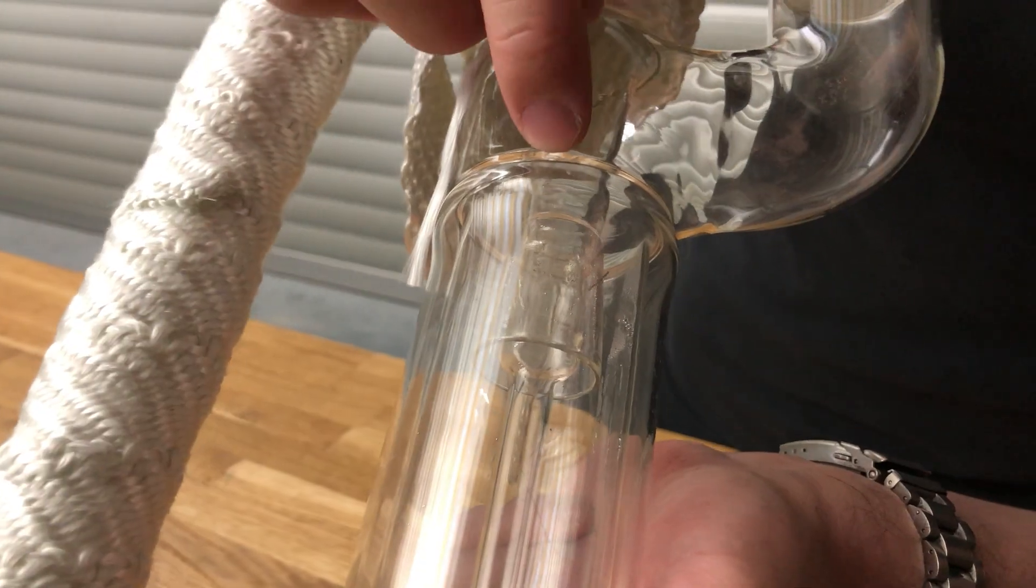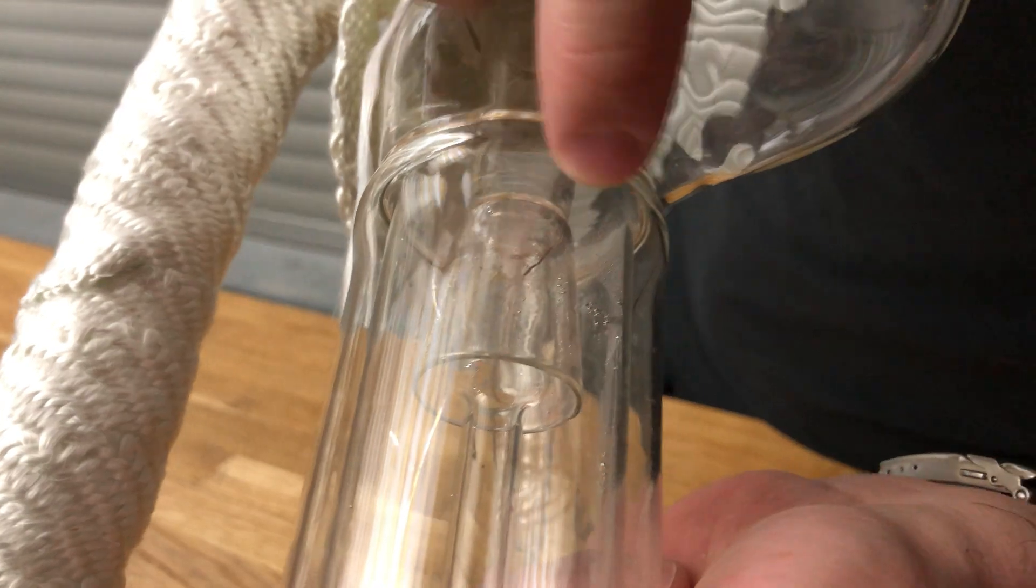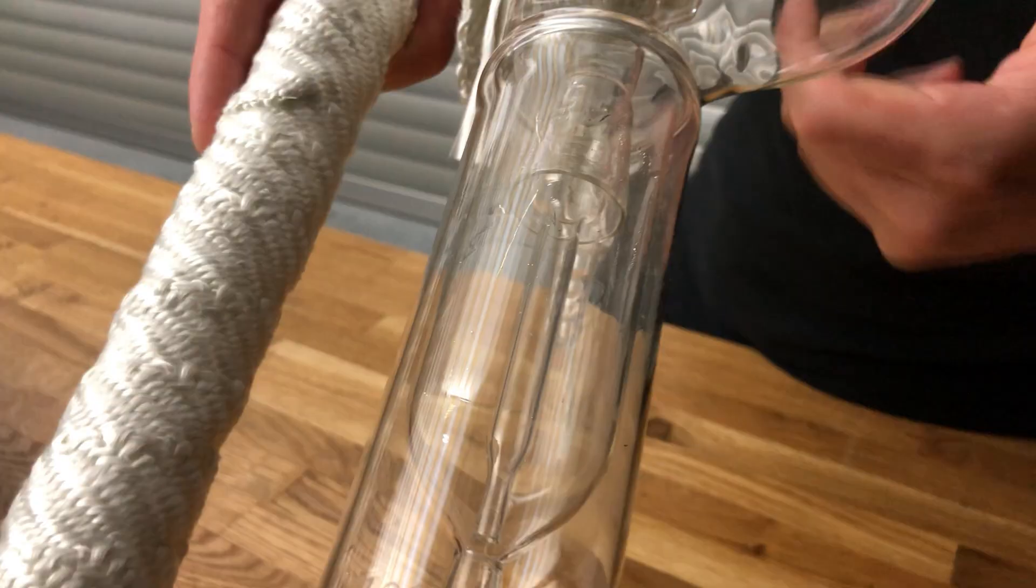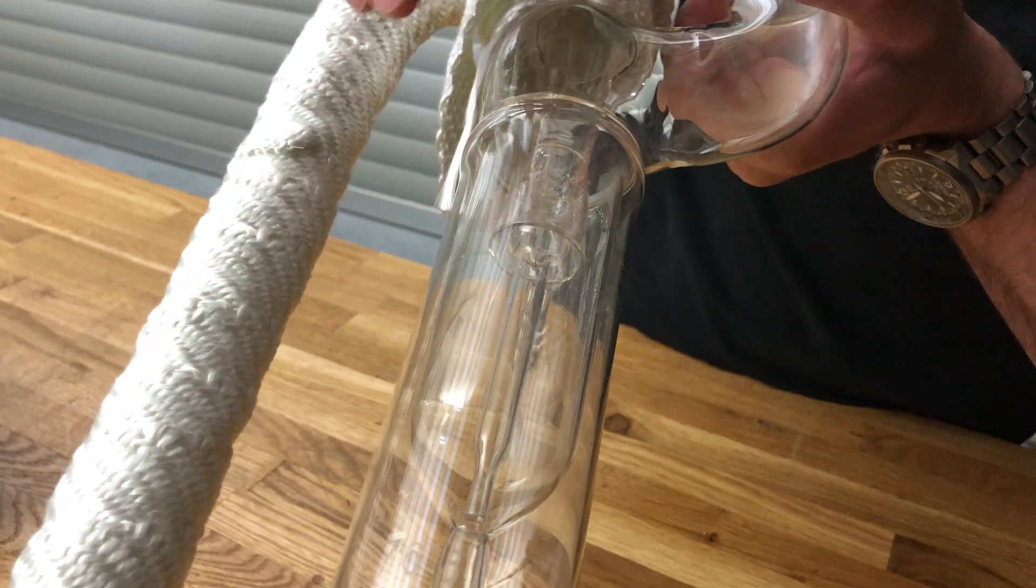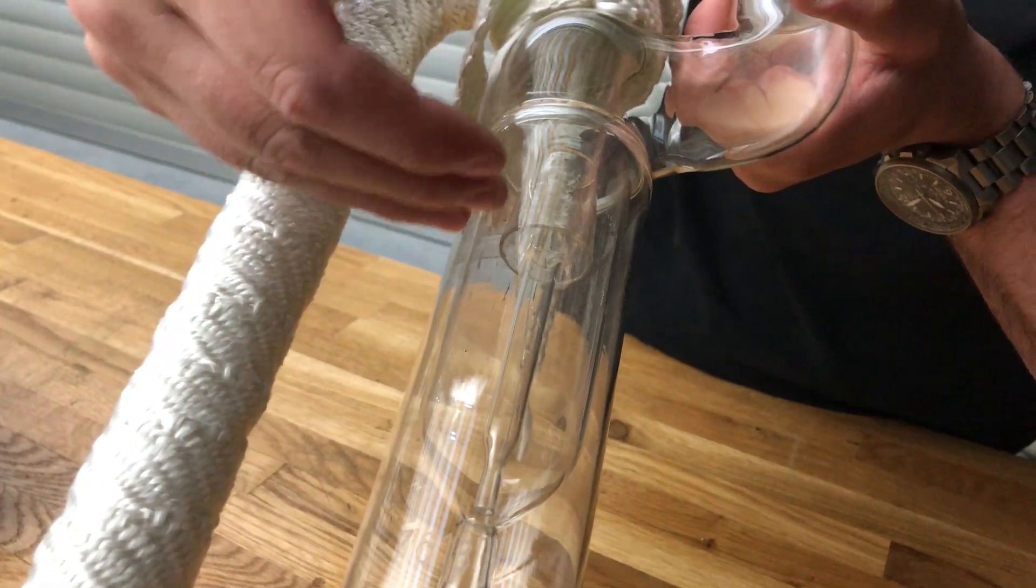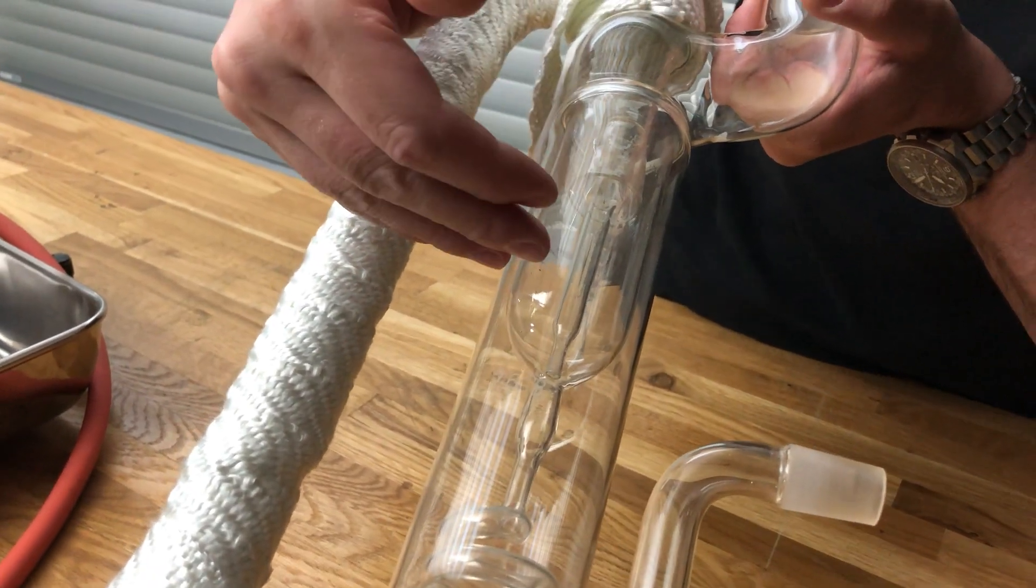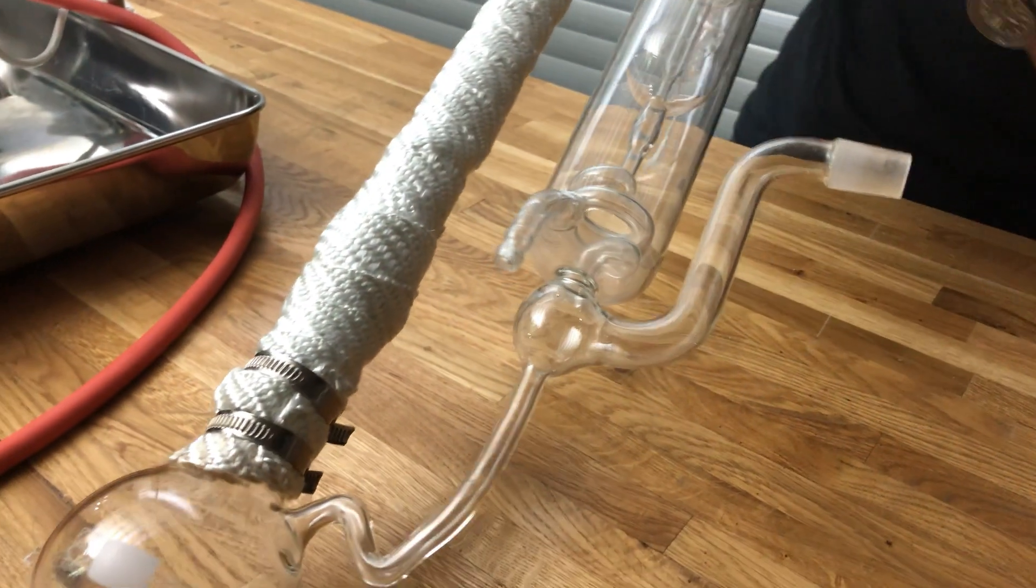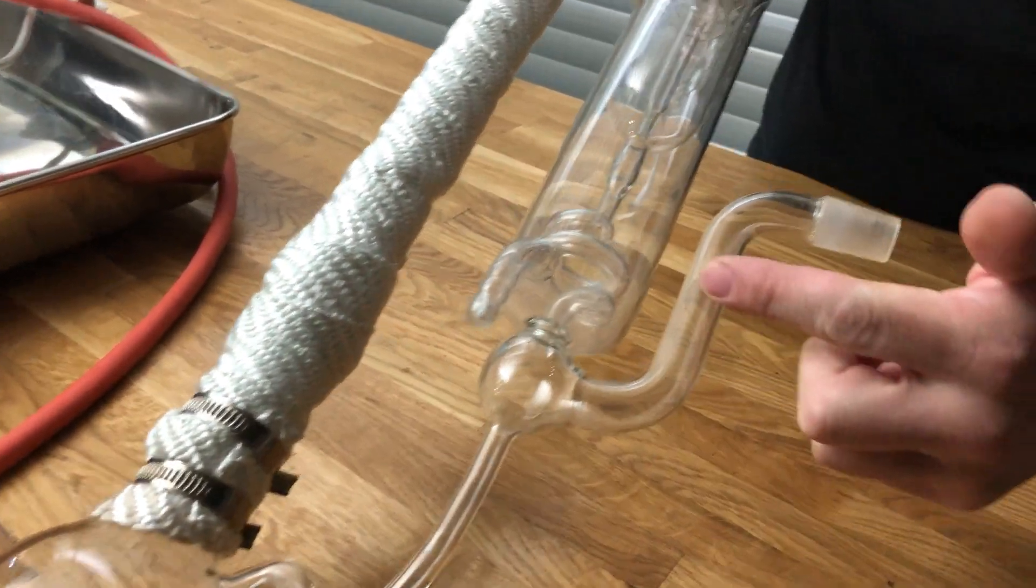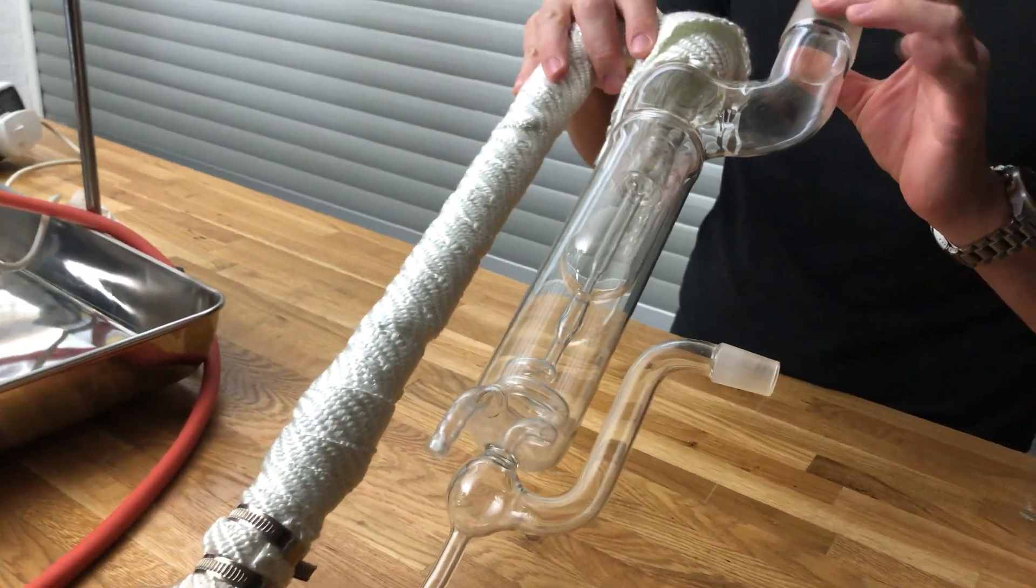Here you can see a funnel and the mercury travels in this inside tube, exits through these small openings inside the funnel and is redirected downwards. All the gas molecules in the vacuum that are still in here basically get carried by the mercury vapor downwards. The mercury vapor transfers its impulse to the gas molecules and they are sort of compressed down here where they can be carried out and evacuated by the roughing pump and are excluded from the high vacuum site on top here.